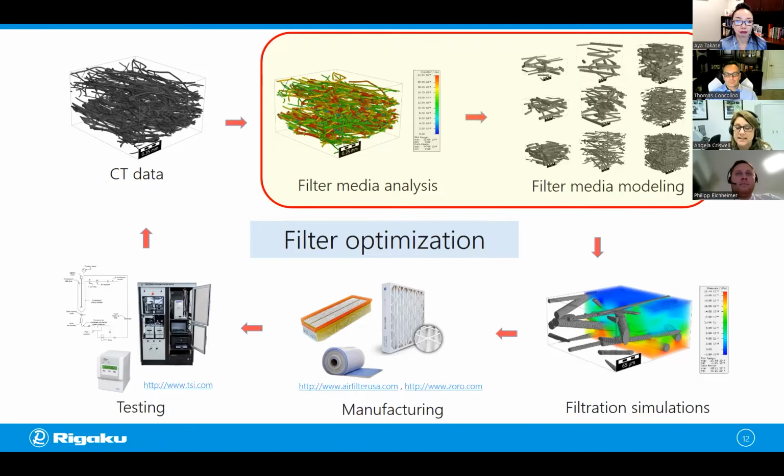Exactly. And we're going to see some of these today. So remember, when you segment, sometimes you can get some errors in assignments. You could have some error voxels that are incorrectly assigned as fiber, and we need to clean that up. Image filtering in this list, which was the winner, is definitely one way to do that. You can also use artificial intelligence, or you can use morphological operations. And Otsu binarization is the first step usually before you go to cleanup. So 3 of them were correct in this case.